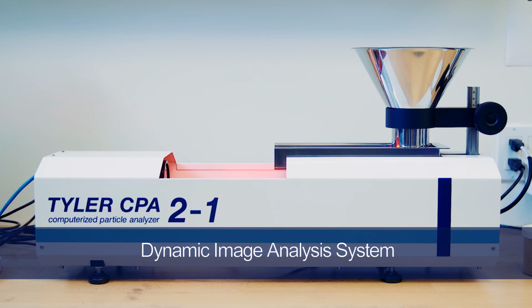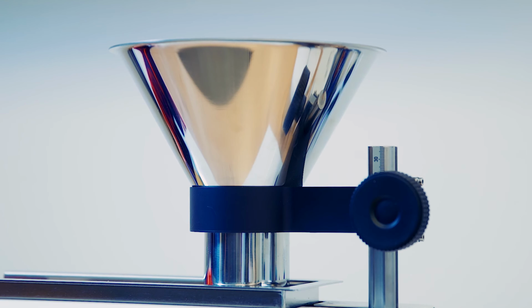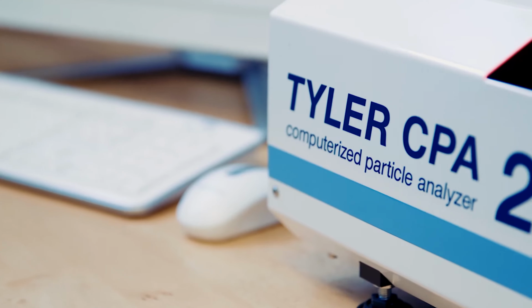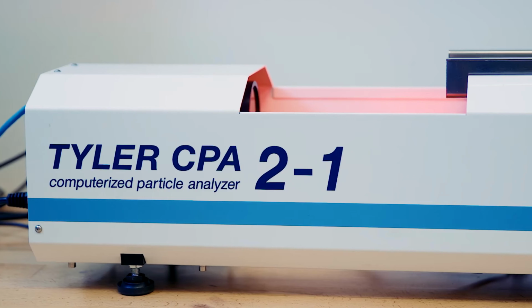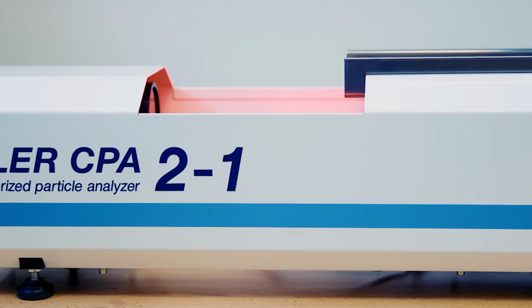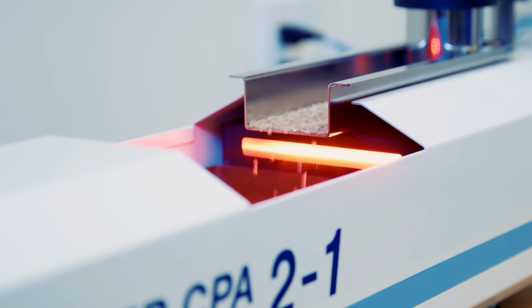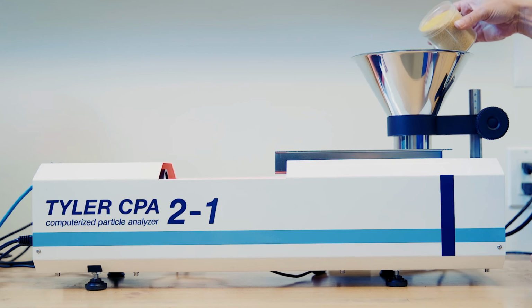Dynamic image analysis systems like the WS Tyler computerized particle analyzer make obtaining the same particle analysis results of the other equipment, but in a digital format. It also stands as one of the fastest options on the market. This is especially beneficial for the mining operations that handle the initial blast mining of the raw material. These operations typically employ a dynamic image analysis system as they have to test upwards of 20 samples each day. But it should be noted that dynamic image analysis systems have yet to be reflected in industry standards.